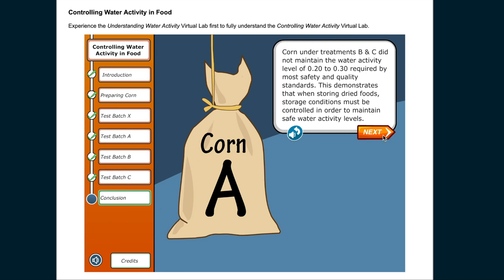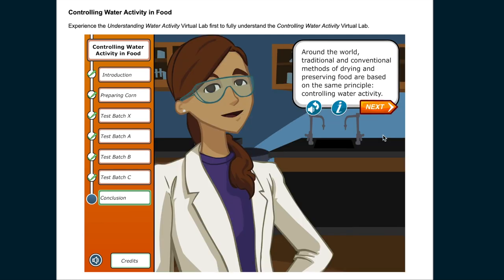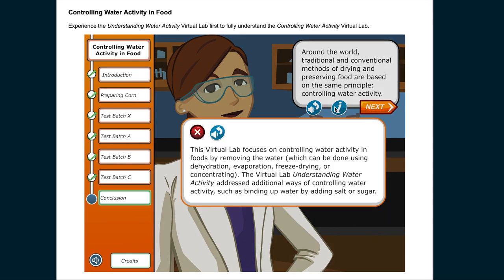Corn under treatments B and C did not maintain the water activity of 0.2 to 0.3, required by most safety and quality standards. This demonstrates that when storing dried foods, storage conditions must be controlled in order to maintain safe water activity levels. Around the world, traditional and conventional methods of drying and preserving food are based on the same principle, controlling water activity. This virtual lab focuses on controlling water activity in foods by removing the water, which can be done using dehydration, evaporation, freeze-drying, or concentrating. The virtual lab Understanding Water Activity addressed additional ways of controlling water activity, such as binding up water by adding salt or sugar.